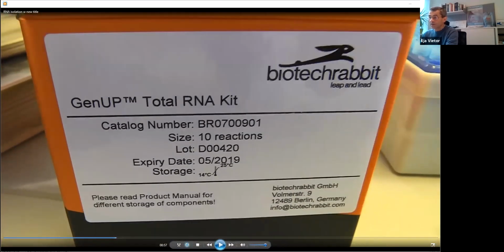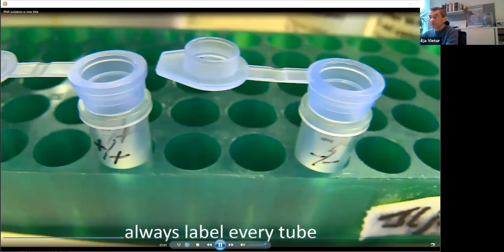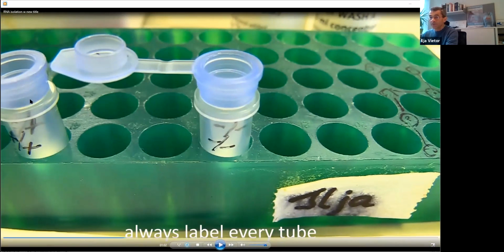This is the kit, so I'm not advertising this particular product, it is only for your information. What would you use if you do this experiment? We are starting with the first step with these columns. What is important and necessary is always to label everything and be careful, because ethanol is removing the labeling. If you are working with many samples, it's dangerous.